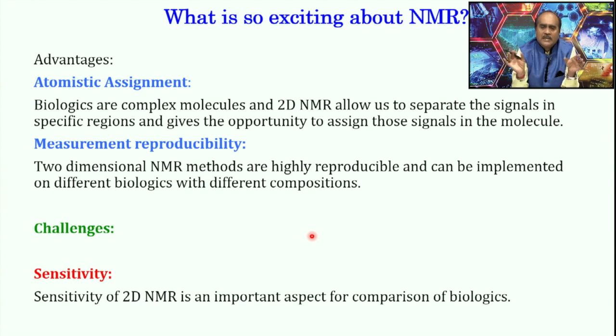If you are not changing any parameter like temperature, pH or molecule, every time you record the spectrum without any deviation, you get an exactly reproducible spectrum. So that is a great thing. Even for batch to batch analysis, this kind of measurement ensures you that you do not introduce any variation in batch to batch preparation. The only challenge with NMR is that it is a low sensitivity technique, therefore it requires quite a bit of sample to analyze.